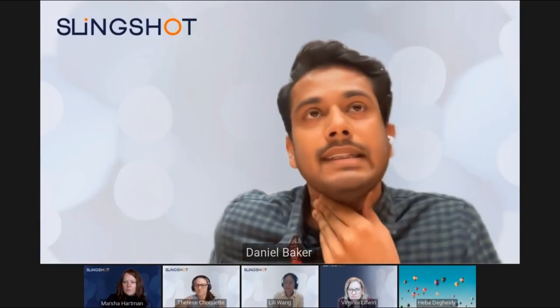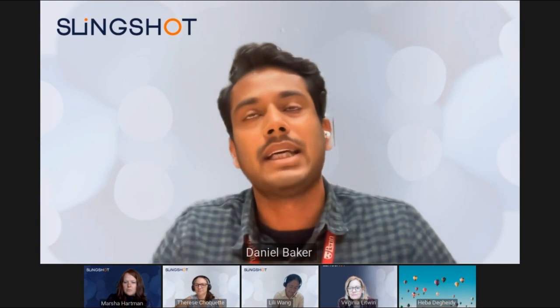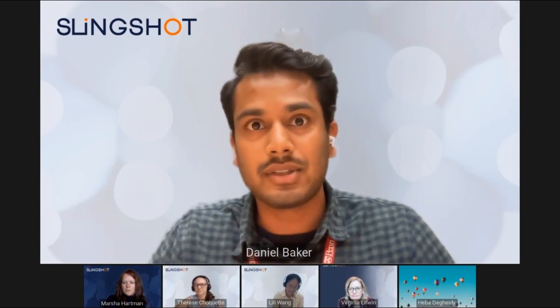Yeah, I can take it. So, Phil, I think it's a really great question. Cell therapies are an entirely distinct platform of therapeutics. One of the reasons it's so important to have these very stringent and precise controls is that it's not the same thing as having 1% of a drug circulating in your system. If you have 1% of your blood cells or T cells being CAR T cells and you don't know that, that's dramatically different, whether it comes to toxicity or efficacy. That matters a lot.